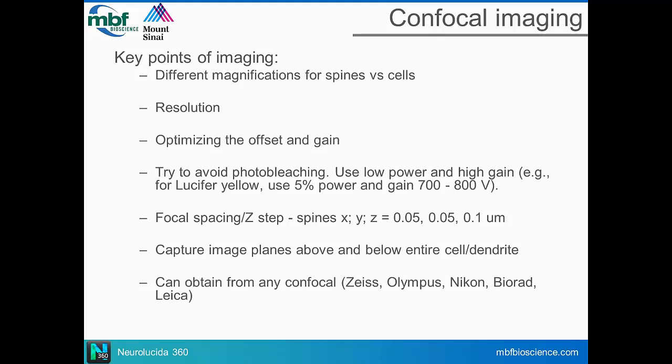Even if it's just 4 or 5 or 6 tiles, or 11 tiles in the case of that neuron you were talking about before, or hundreds of tiles when you're talking about a CLARITY specimen, the technology is advancing rapidly, and the volume of image data that you have to quantify from is increasing exponentially. So it has an important part to play in all aspects of your experimental design, for sure.